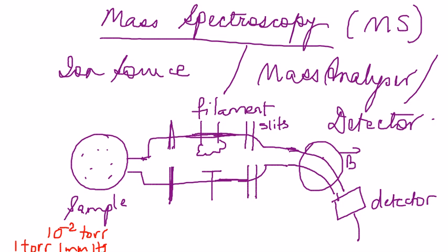So this is a pretty low pressure, and we have to do this because ions are reactive. They're short-lived, so their formation and the way they would move around should be done in vacuum, and should not be done at atmospheric pressure. So usually the pressure that we will use will be somewhere around here, and that can be taken to be approximately close to vacuum. You can go lower than that. You can make it 10 to the power of -5. That's pretty good too. Now, how do we accomplish running the MS?